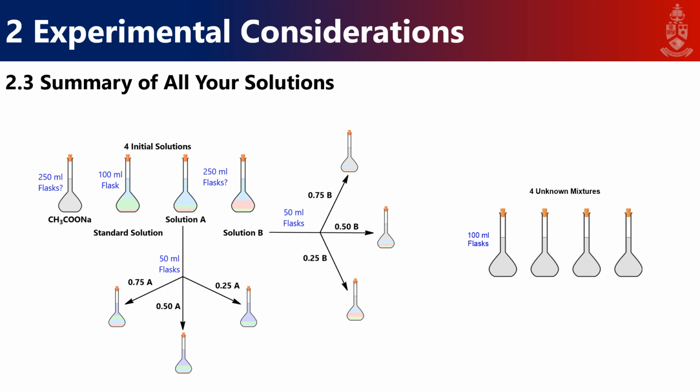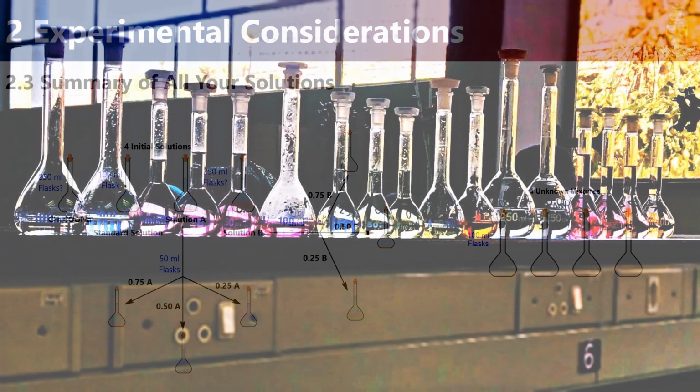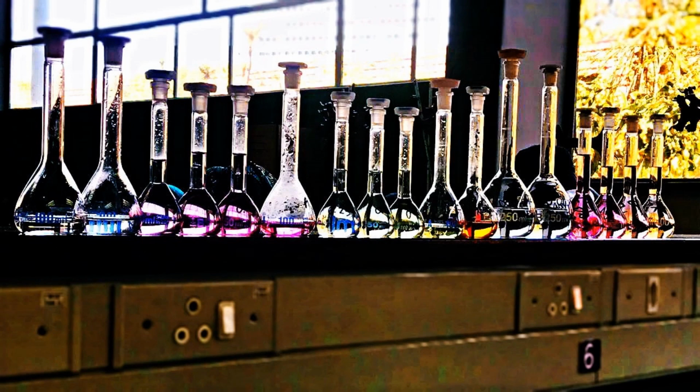Okay, and get ready for it. This is the coolest picture you'll ever see in your life. You should end up with something that looks like this, a bunch of beautiful solutions, all different, well, not different colors, or different shades of red and yellow. This is actually a picture from my 3rd year when I did this practical. It should make for some beautiful work, which I hope gets you excited to do this practical for yourself.